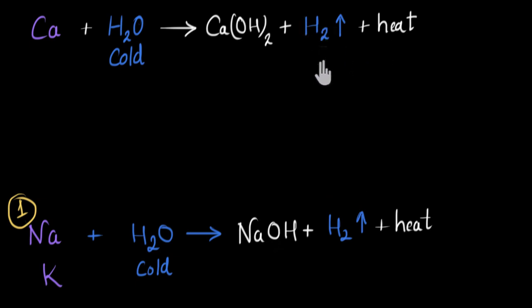It's lesser in comparison to sodium. And that's why we rank calcium as second in the reactivity series. So in the case of sodium and potassium, the heat would even burn the hydrogen, whereas in the case of calcium, the heat is not sufficient to burn the hydrogen gas.